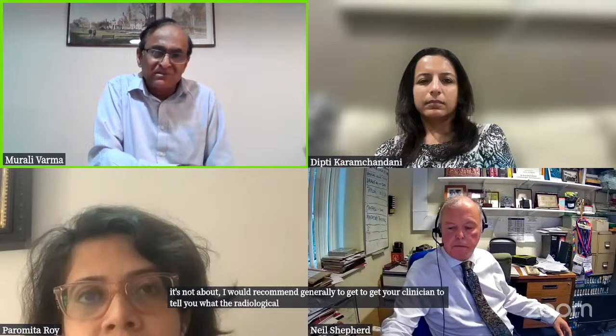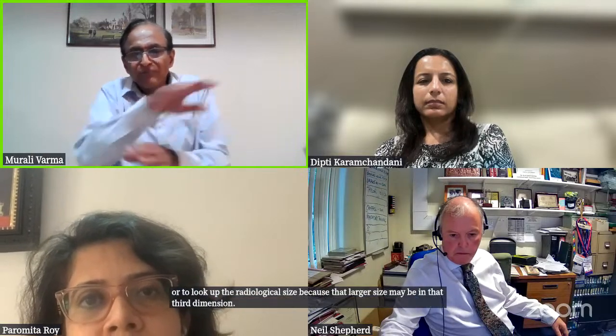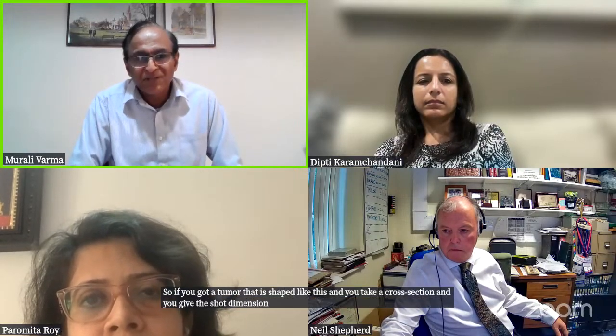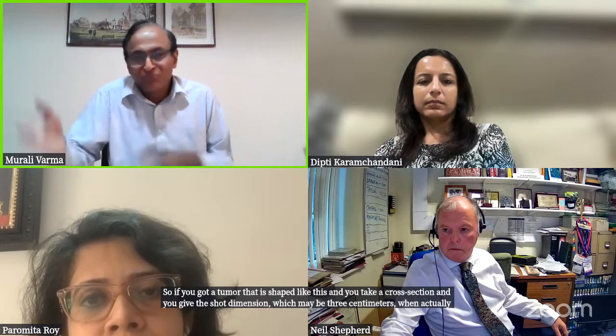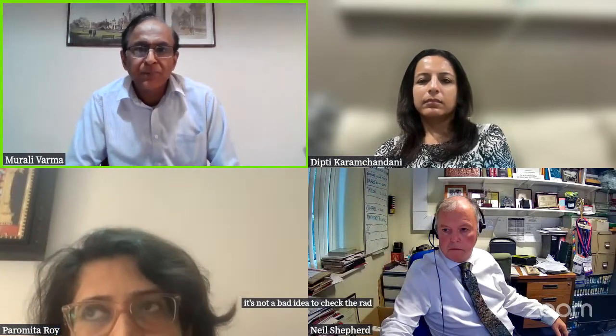But the only thing I would say, for example with a renal tumor, is that I would generally recommend getting your clinician to tell you the radiological size of the tumor, or looking up the radiological size, because the larger size may be in that third dimension. If you have a tumor shaped like this, and you take a cross section and give the short dimension, which may be 3 centimeters, it might actually be 7 centimeters or 4. So especially for the ones close to the cutoff, it's not a bad idea to check the radiology report when you're doing the cutoff.